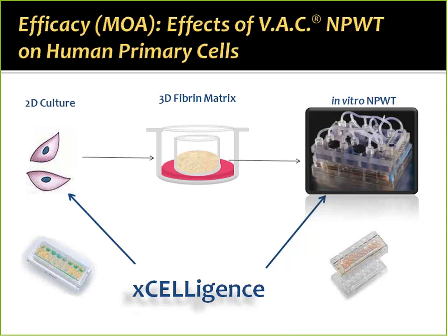The xCELLigence monitors migration at 15-minute intervals, which is really our preferred setting for any length of time. So now we analyze the effects of secreted factors in media after treatment on different cell types using the xCELLigence RTCA system. And I think most of you are familiar with the technology, but I'd like to briefly review how the xCELLigence technology works so that we all have a good understanding of why it works so well for us in the lab.